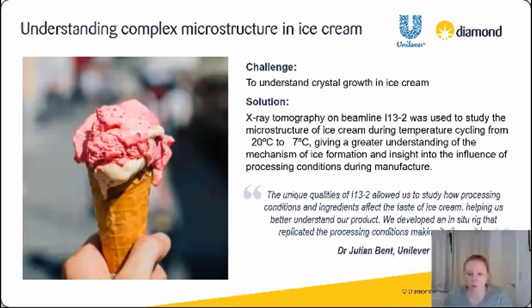We had some work done at the University of Manchester and Unilever looking at ice crystal nucleation and growth in ice cream, which is, of course, quite a complex material. And so you can see how the ice crystals would nucleate and grow. So they're like particulates here. You're looking at these ice crystals as particulates through a matrix.